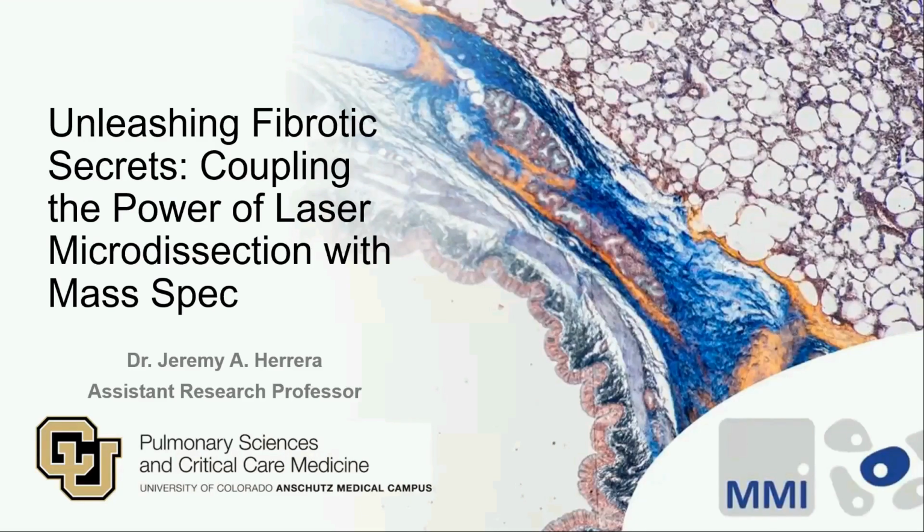Thank you so much for that introduction. Today, what I want to talk to you about is laser capture microdissection coupled to mass spectrometry so we can unleash fibrotic secrets.